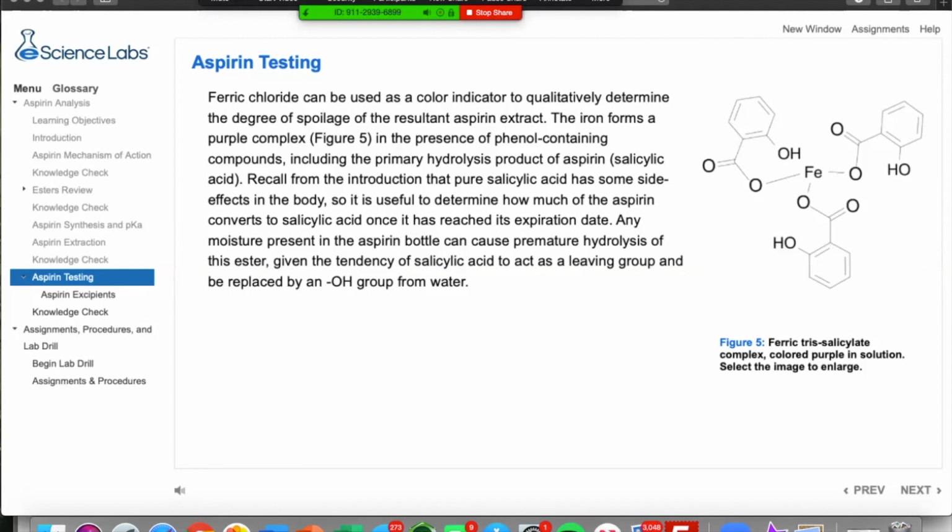Please remember that ferric chloride will stain anything and everything. Remember to wear a lab coat for this experiment, or your shirt could potentially be stained brown forever.